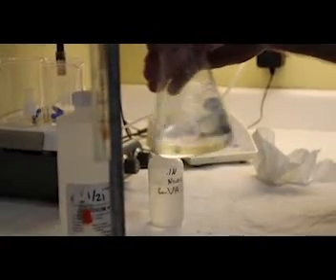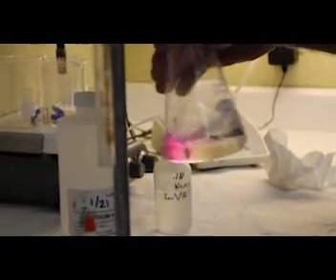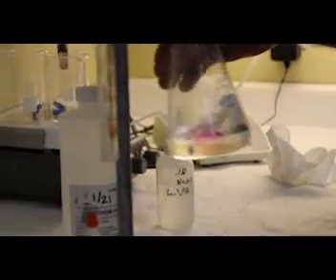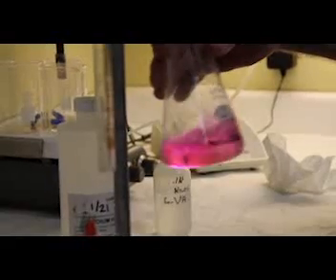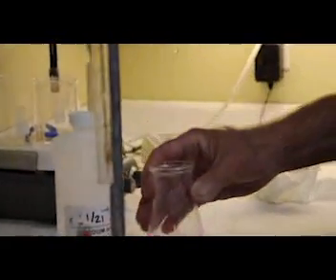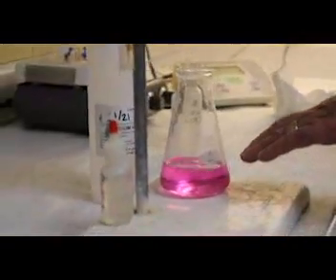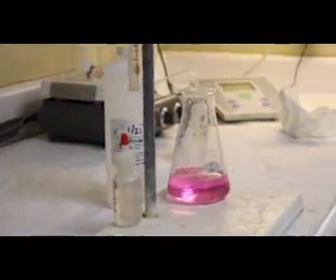See, it's still eating up the sodium hydroxide, and then when it's completely done and it stays red for a little while, see, it's still dissolving a little bit. Now it's stayed red there, and then it'll stay red in here. If it goes back to clear right away, then you know you haven't added enough.